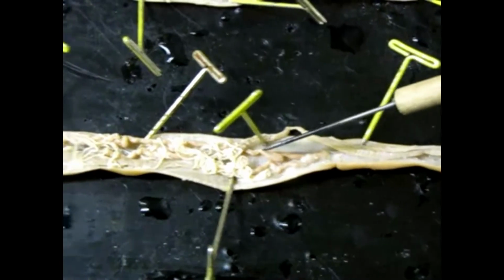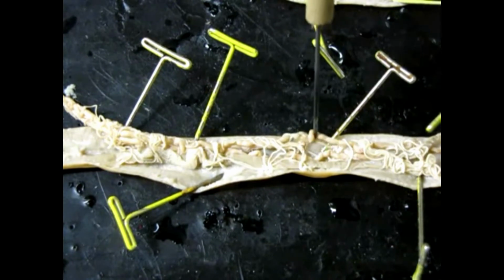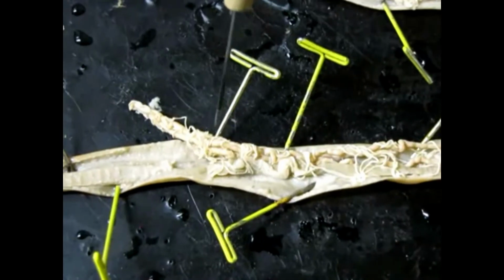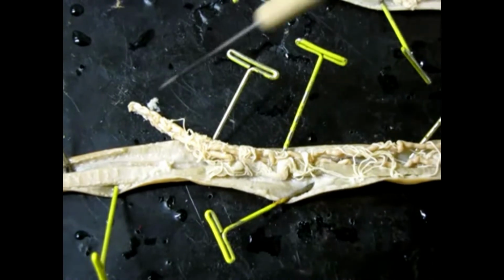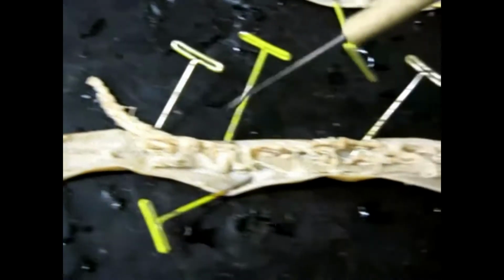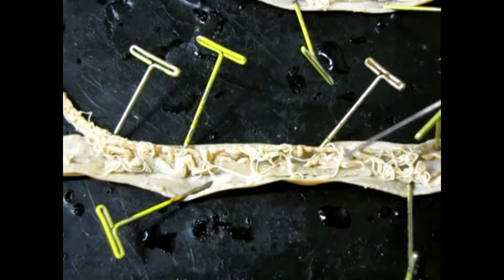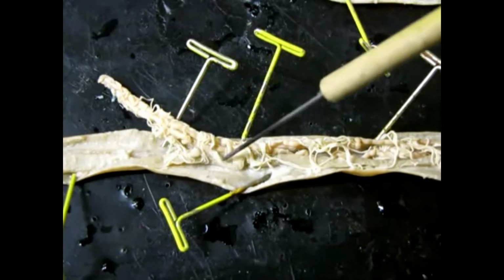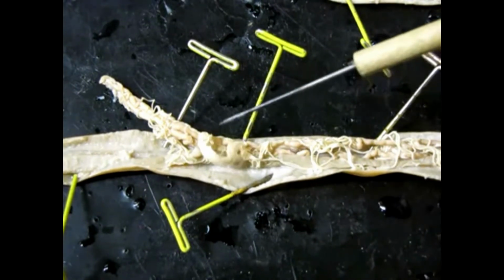Now we can follow these uteri pretty much the entire length of the body. Here they are here. There's more down here, these two thick tubes. So those are the uteri, and then eventually down near the bottom, they narrow off into these much thinner little spaghetti-like structures, and further on, even thinner, very, very thin and delicate little threads down here.